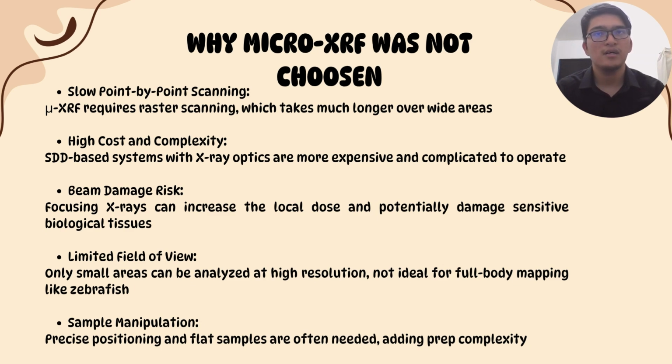The third one is beam damage risk. Focusing X-rays can increase the local dose and potentially damage sensitive biological tissues. The fourth one is limited field of view, because only small areas can be analyzed at high resolution, not ideal for full body mapping like zebrafish. And lastly, because of sample manipulation, precise positioning and flat samples are often needed for micro X-ray fluorescence, which adds prep complexity.